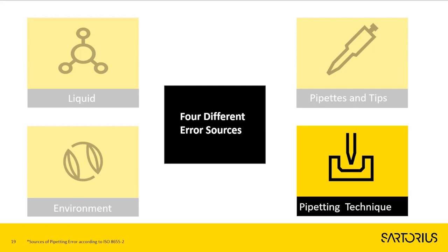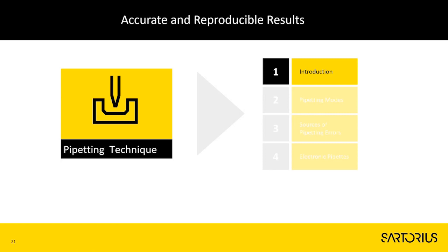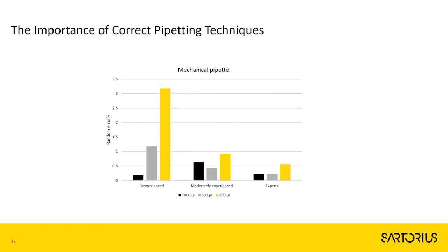So we're now going to move on to pipette technique. First of all, I'm just going to introduce why pipetting techniques are so important. This graph is showing the random error with different volume mechanical pipettes and how the experience of the user can affect the random error. From this graph, we can see that experienced users have less random errors and those that are inexperienced have a lot more. What this graph illustrates is that good pipetting techniques are critical to get good results in small volumes.